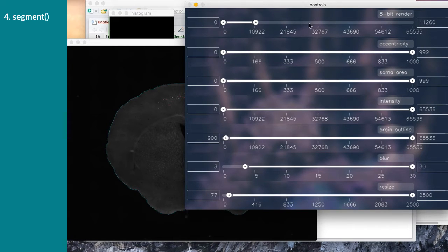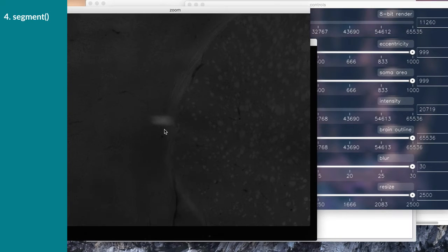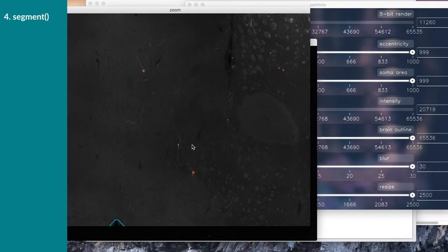So we normally start with setting the intensity range where we have GFP signal in this case. As you saw from the imshow command, it starts somewhere around 6,000 and ends somewhere around 20,000. That's the range where we find neurons. So this is normally a good place to start. You can already see it looks a little bit nicer. We seem to find the cells, and we don't get autofluorescence, like dirt on the glass and stuff like that, showing up as cell signal.